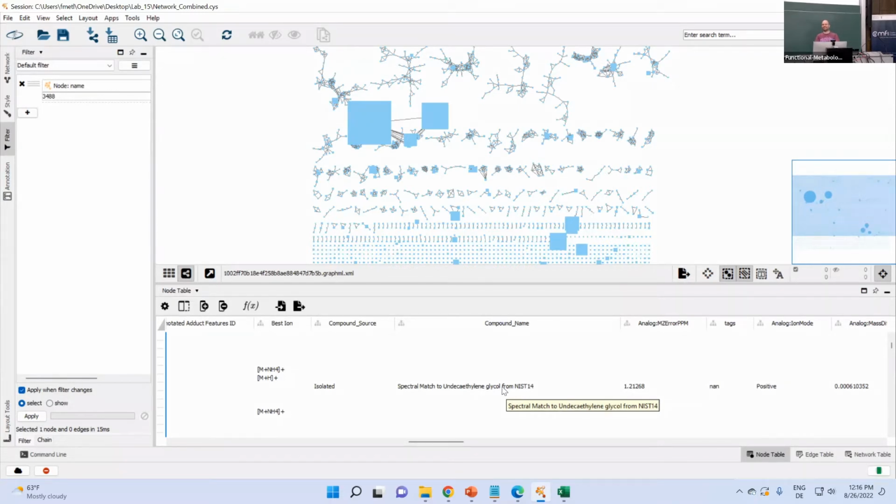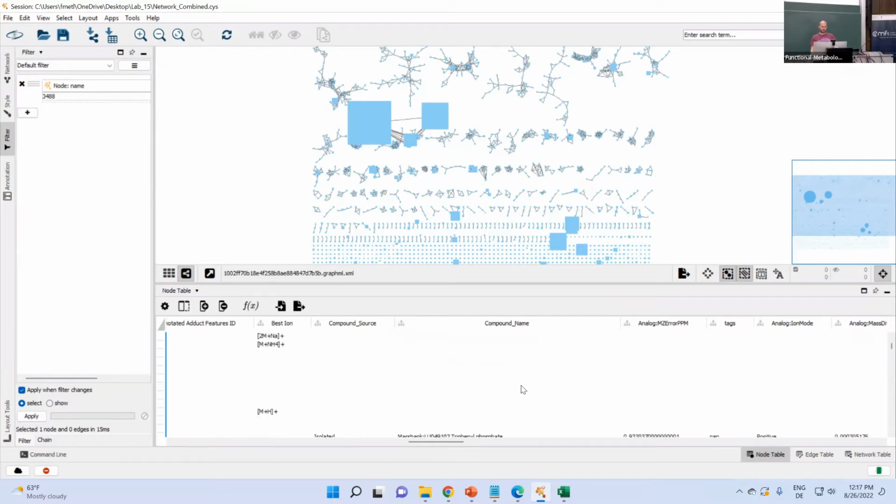Okay, what do you guys think? What could that be? No, that's PEG, polyethylene glycol. It is an environmental contaminant we frequently observe, but it's also a very frequent contaminant we see in all sorts of samples. It's a lubricant often used for filter coating, in syringes, to make things go smooth. So it's really widely used and we see it a lot. So if I would see that, I would always be cautious. Doesn't mean that it's not in your sample, but that's a common contaminant, similar to plasticizers.